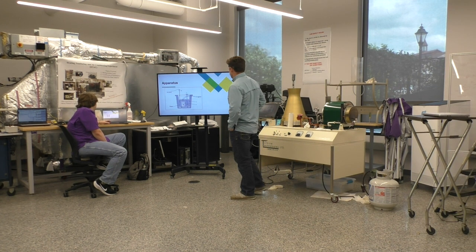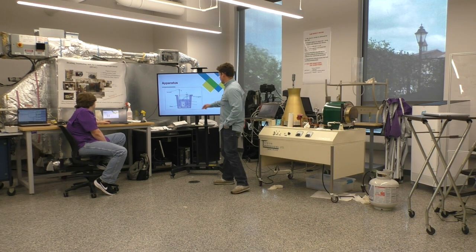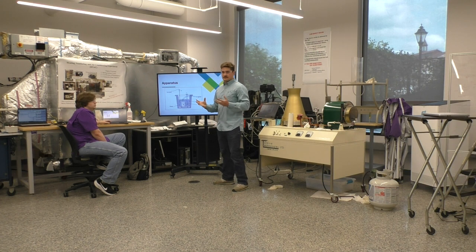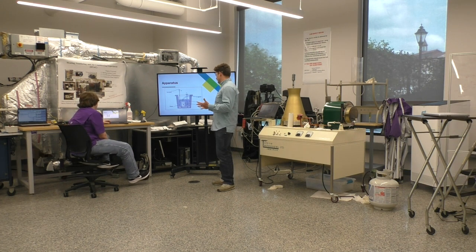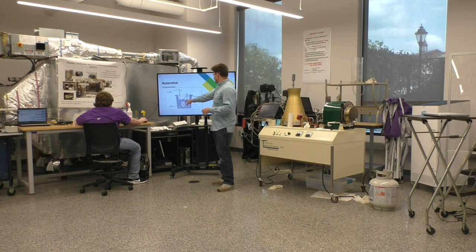Next slide. So, quick apparatus. The bomb calorimeter is going to be submerged in our water in our vessel. We're going to ignite this substance. It's going to create heat, which will then heat up the surrounding water. And we're going to measure that with the DAC software.